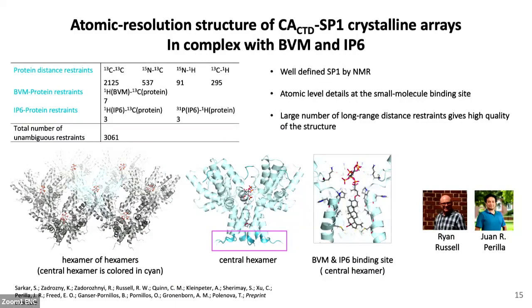You don't have to answer this necessarily, but do you have any thoughts about why, if the molecule is so well localized, it's not visible in the crystal or the cryo-EM structures? In cryo-EM and X-ray, they apply a symmetry to model those small molecules inside the electron density map.